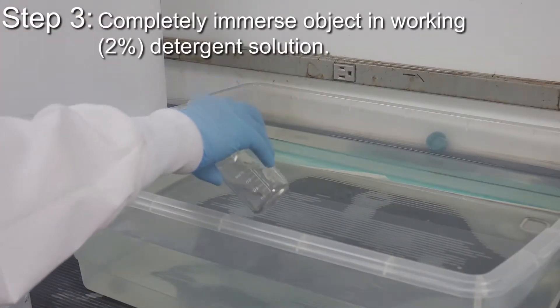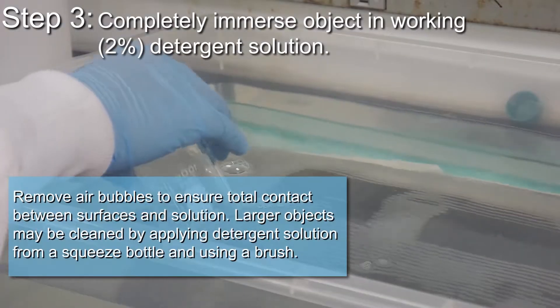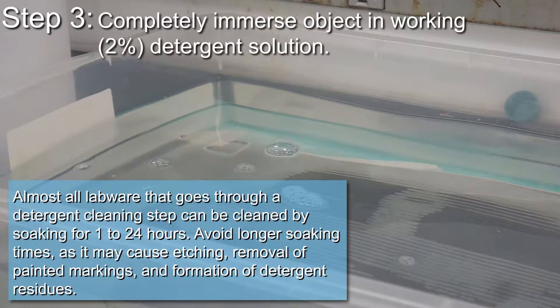Completely immerse the object in a working 2% detergent solution. Remove air bubbles to ensure total contact between surfaces and solution. Larger objects may be cleaned by applying a detergent solution from a squeeze bottle and using a brush. Almost all labware that goes through a detergent cleaning step can be cleaned by soaking for 1-24 hours.